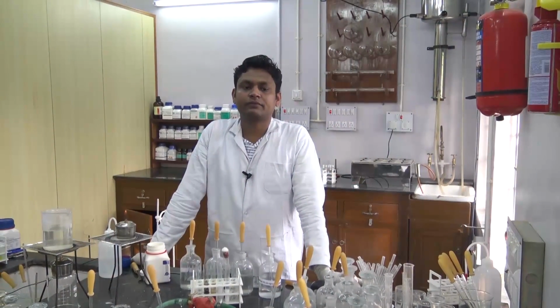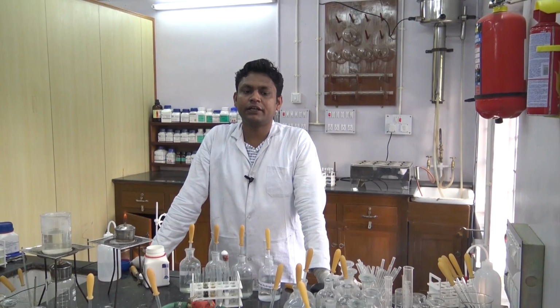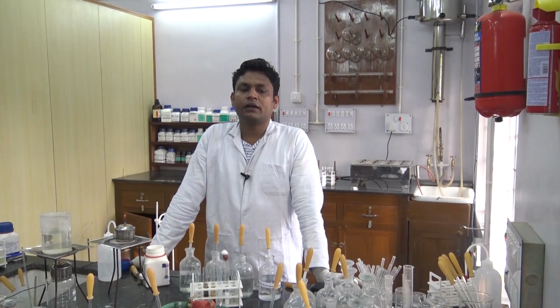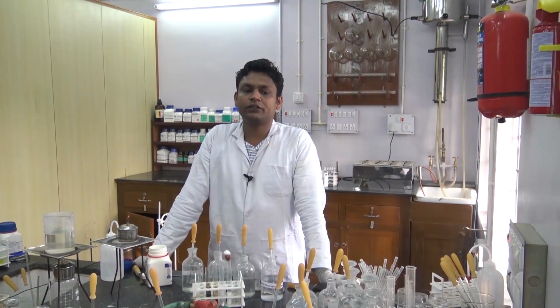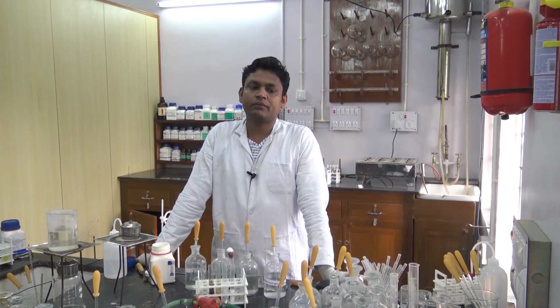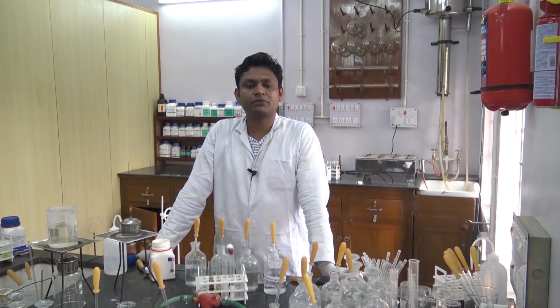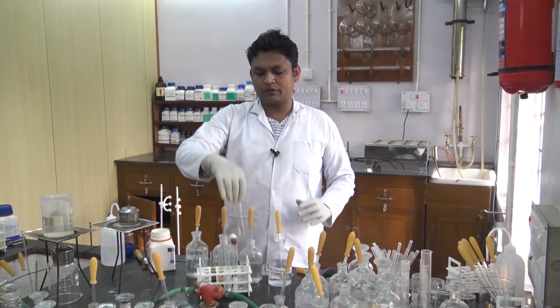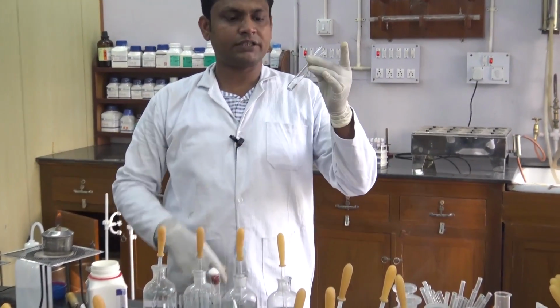If group 4 precipitate is not identified, then perform the confirmatory test for magnesium, and there is no special group reagent for potassium, ammonium, sodium, and they must be identified by the individual confirmatory test. Now I have taken the magnesium ion for presentation.